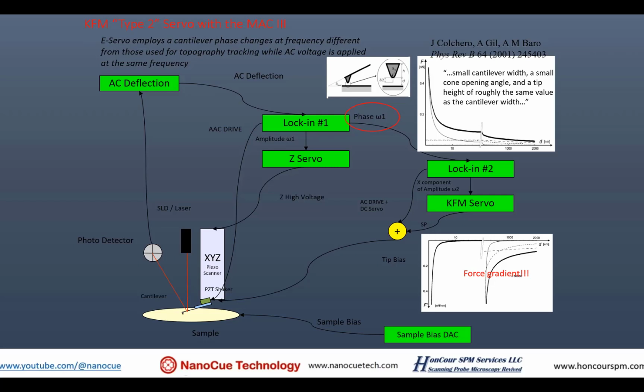You're measuring these sidebands that are generated on the resonance frequency of the drive frequency of the cantilever. So it avoids the sensitivity to any cross coupling in the cabling, or cross coupling even externally through the sample or otherwise into the detector.